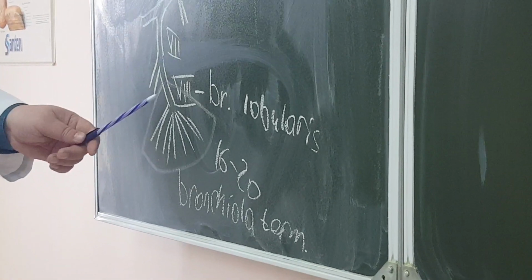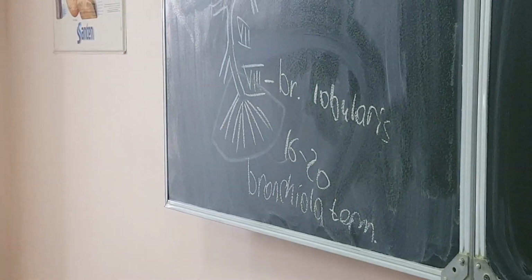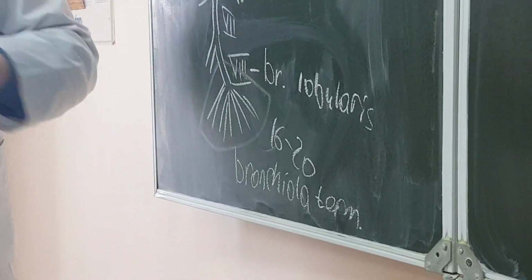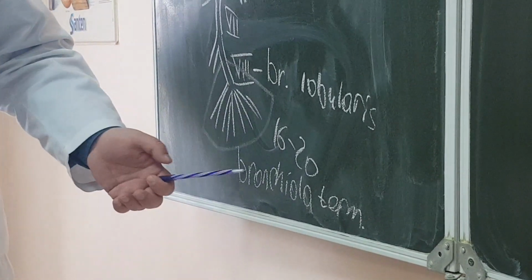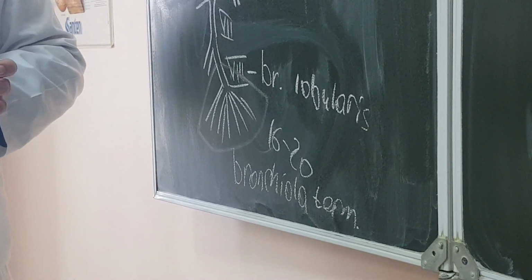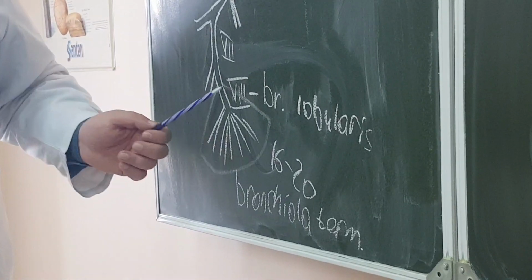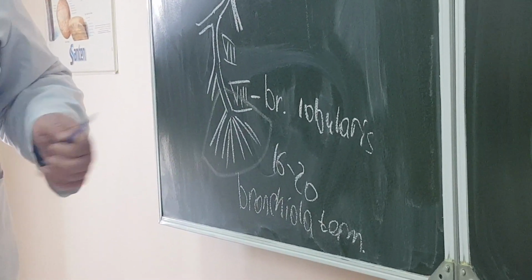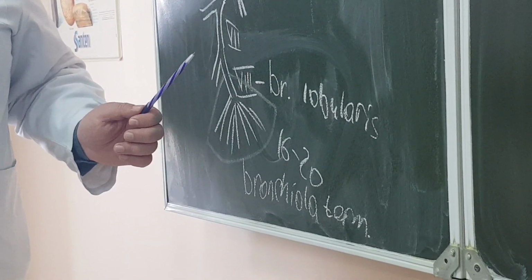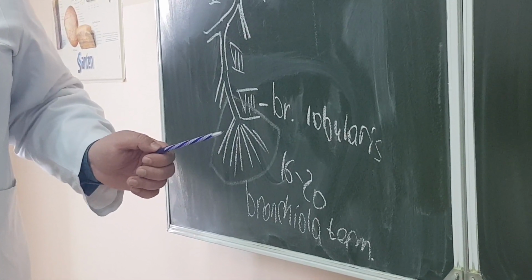But the wall of the bronchus has cartilage. Small drops of cartilage, but cartilage is present. In bronchioles, cartilage is absent, and the same in bronchioli terminales, absent mucous glands, but ciliated epithelium everywhere, and smooth muscles, the same both in bronchus and in bronchiole. There is no difference. Only cartilage is absent and mucous glands are absent.